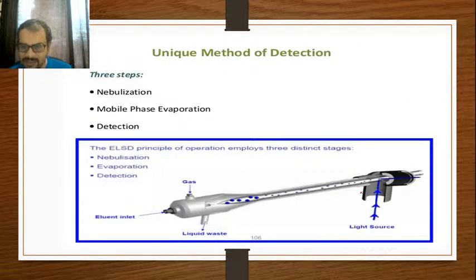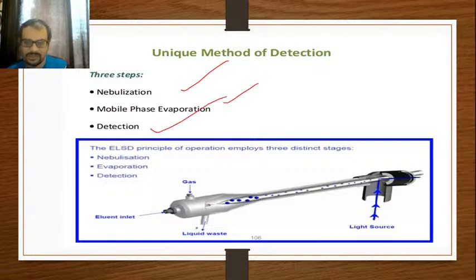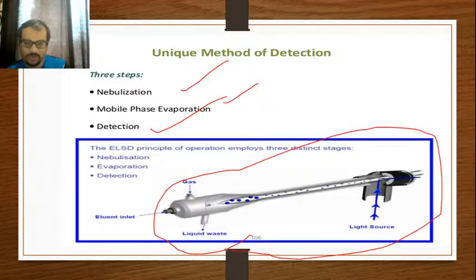ELSD involves three steps, called nebulization, mobile phase evaporation and detection. How these techniques happen, we will have a short overlook over here. This is the instrument which utilizes the ELSD detection system.